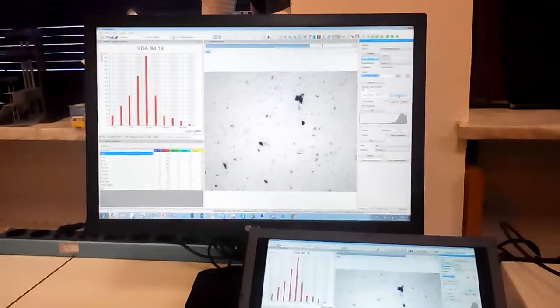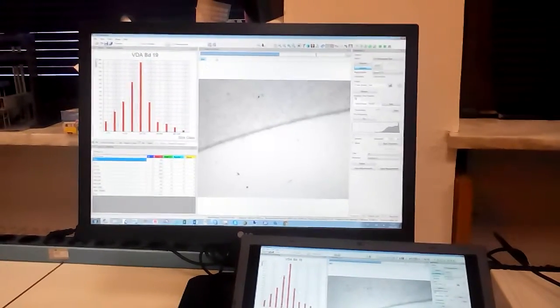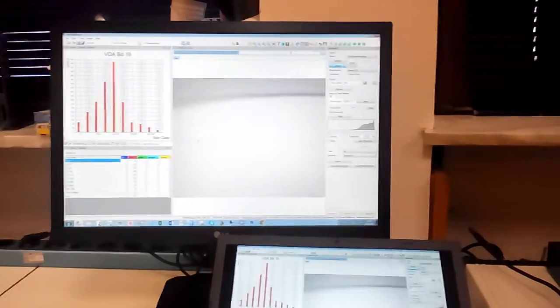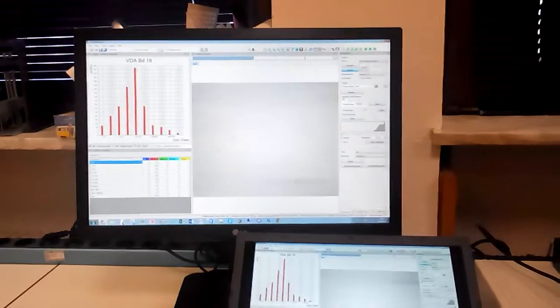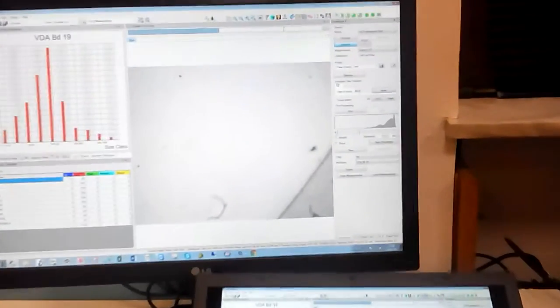So we start with new, and then we are looking for one edge. So it's the first click. You can see here that it counts your numbers. So that's 1 out of 3. So we're basically creating a triangulation, if you like, of the circumference of the filter paper. Then second one, and third one. Good. And now you can see we nearly reached the 47 standard.